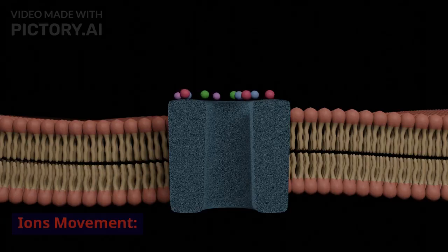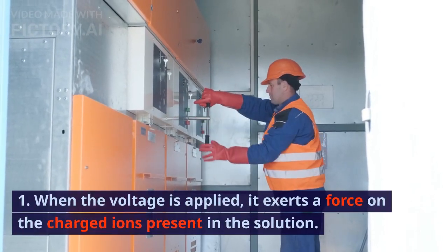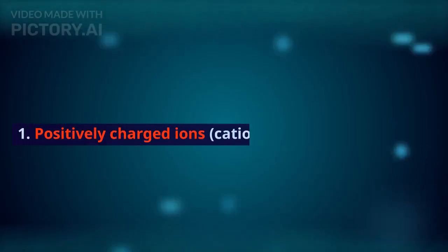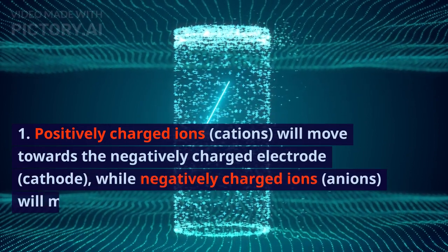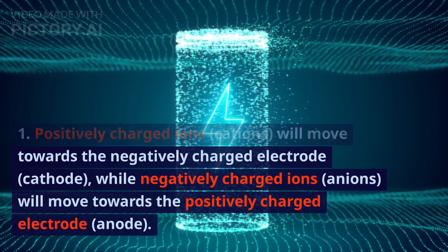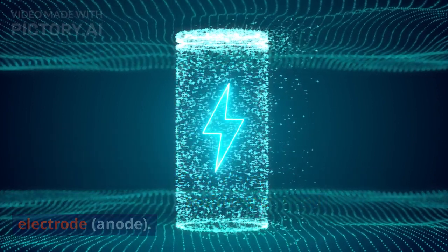5. Ions movement. When the voltage is applied, it exerts a force on the charged ions present in the solution. Positively charged ions, cations, will move towards the negatively charged electrode, cathode, while negatively charged ions, anions, will move towards the positively charged electrode, anode.